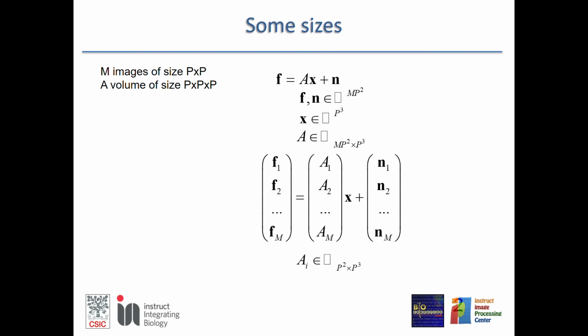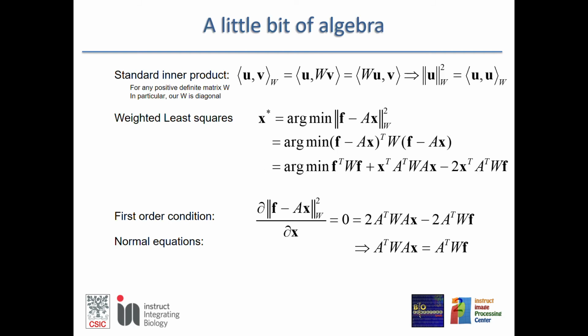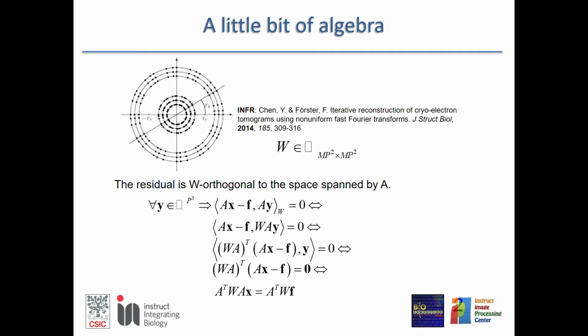One of the most common ways is by making iterative projections, so iterative 3D reconstruction.